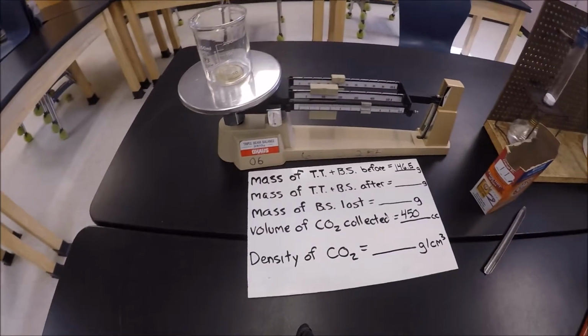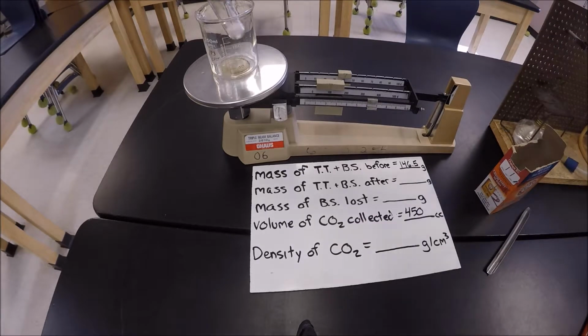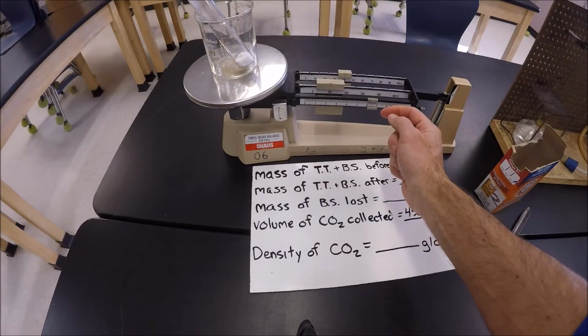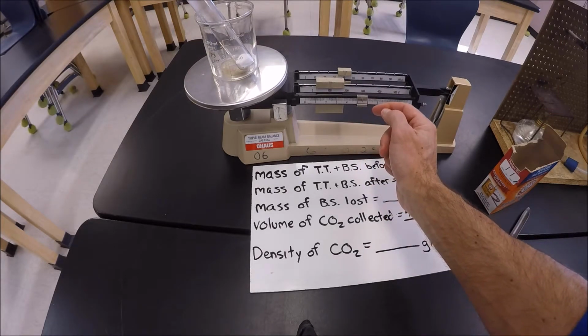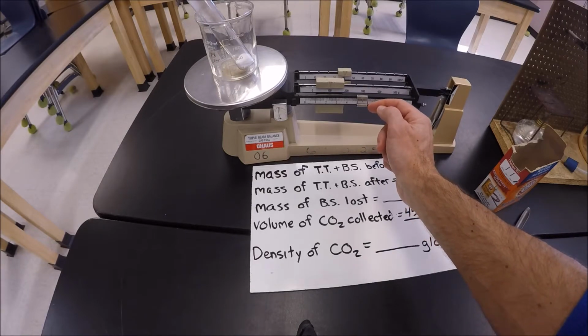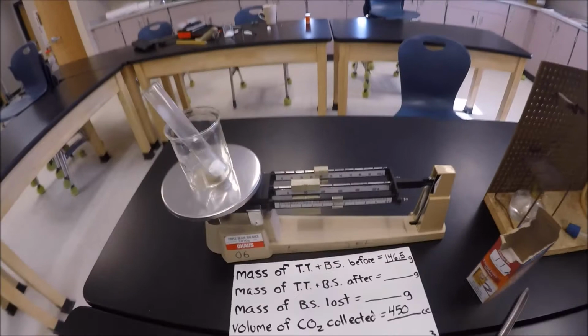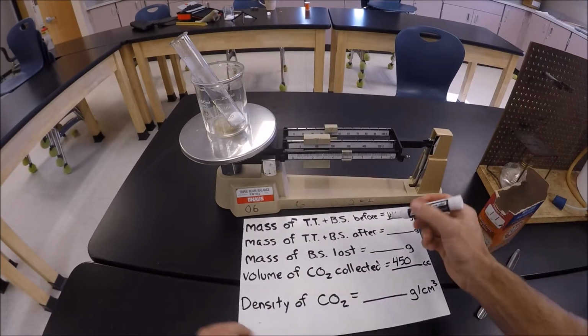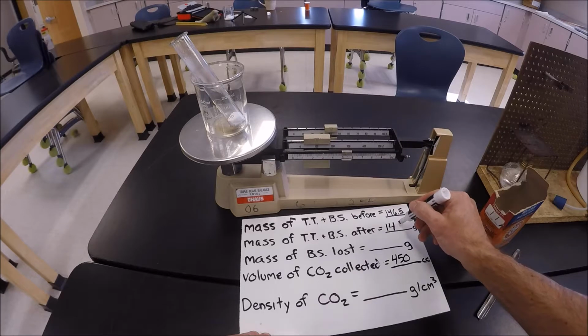Okay? So I also need the mass of the test tube and baking soda after. Now this should be cooled down enough that we can remass this at this point. So let's see what this looks like. I'll pull this off of here. We're going to put this back on the balance. And you'll notice I left it sitting where it was before. It was at 146.5. It's now lighter. I'm going to have to slide this back. And I've got, as you can see, 145.4. So my mass of test tube and baking soda, double check my numbers here, 145.4.